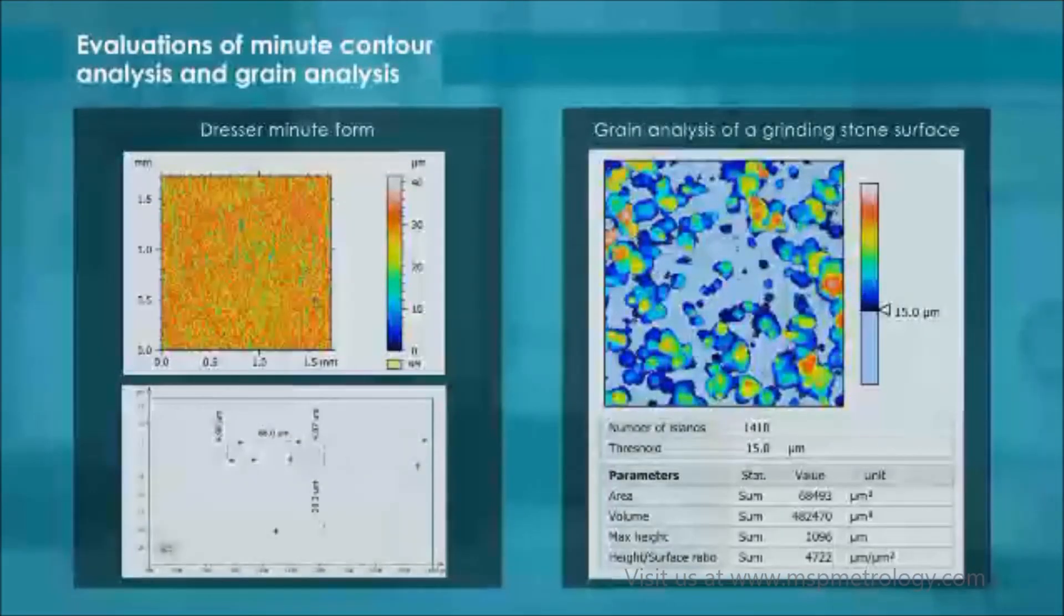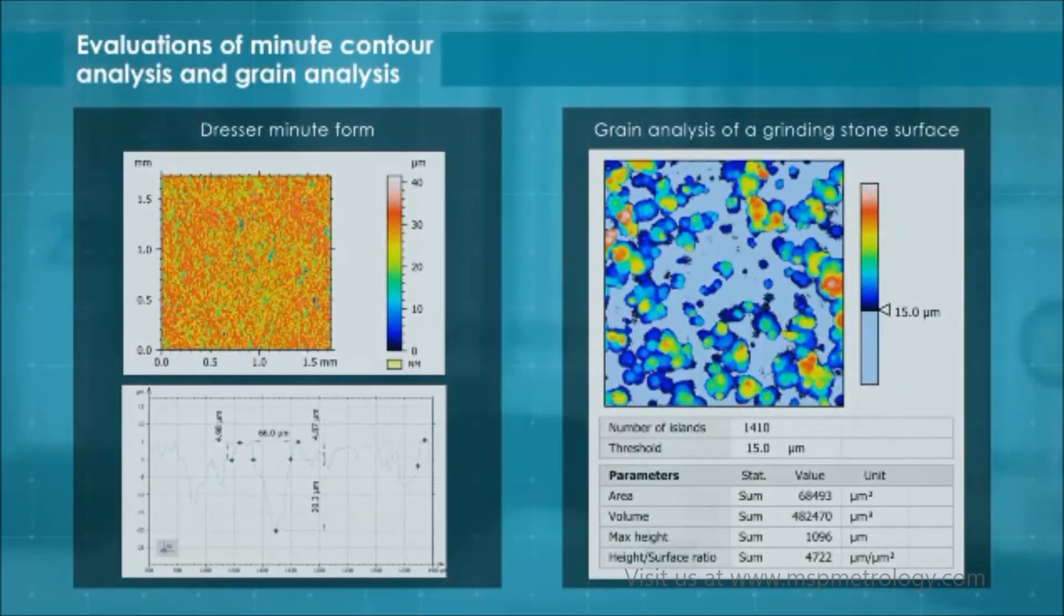Next is the grain analysis and evaluation of the dresser's fine shape or grinding stone surface. This is particularly useful when you want to obtain heights for drawing dimension lines or calculating an area of volume.